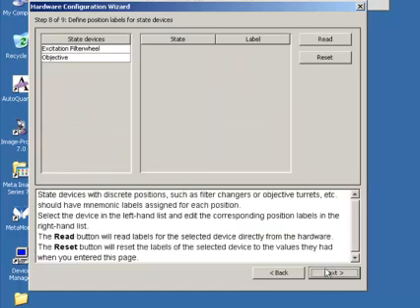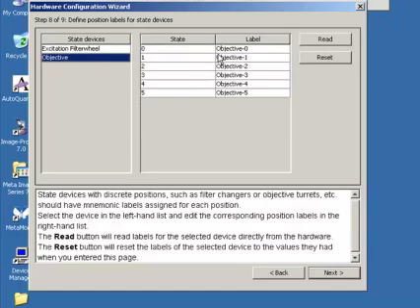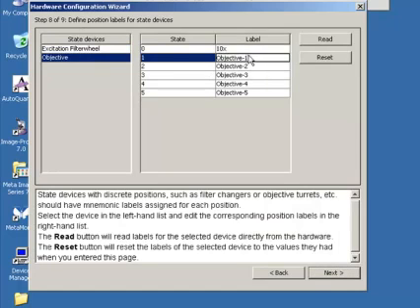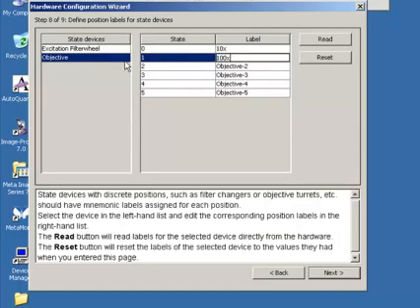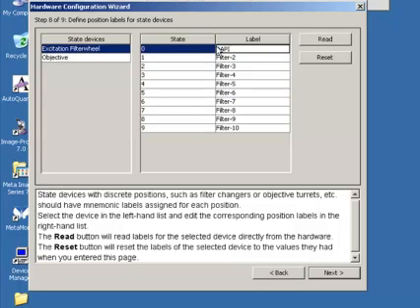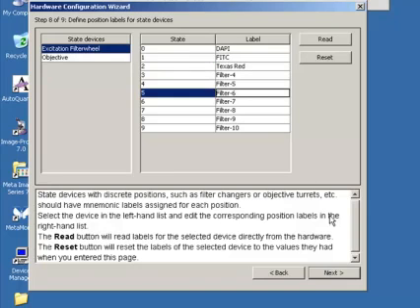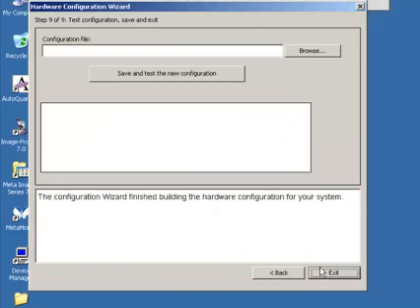And then, work our way through the menus here. The final menu which is worth looking at is this one here which is where we can start defining our filter positions and our objectives. So, on the system here I've actually got a 10 times and a 100 times objective. And in terms of filter positions I've actually got loaded at the moment DAPI as a position one. Fitzy at two and then Texas Red in position three. So, that looks fine to me. So, let's just keep going.